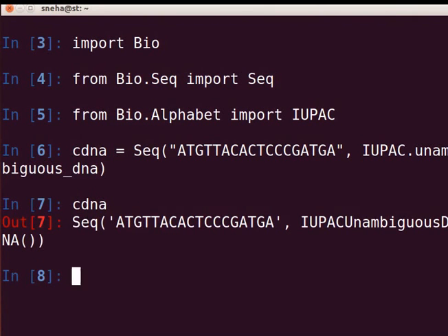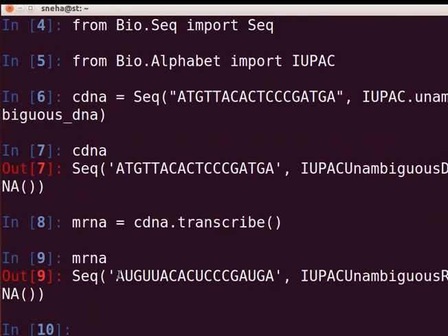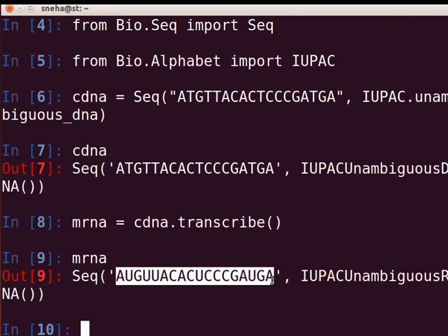Let us transcribe the coding DNA strand into the corresponding mRNA. We will use the Seq module's built-in transcribe method. Store the output in a variable mRNA. At the prompt, type 'mRNA = cDNA.transcribe()' and press Enter. For the output, type 'mRNA' and press Enter. Observe the output: the transcribe method replaces thymine in the DNA sequence with uracil.